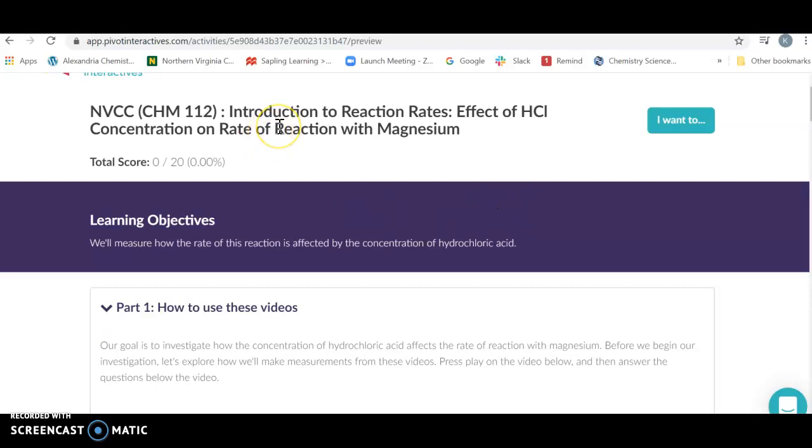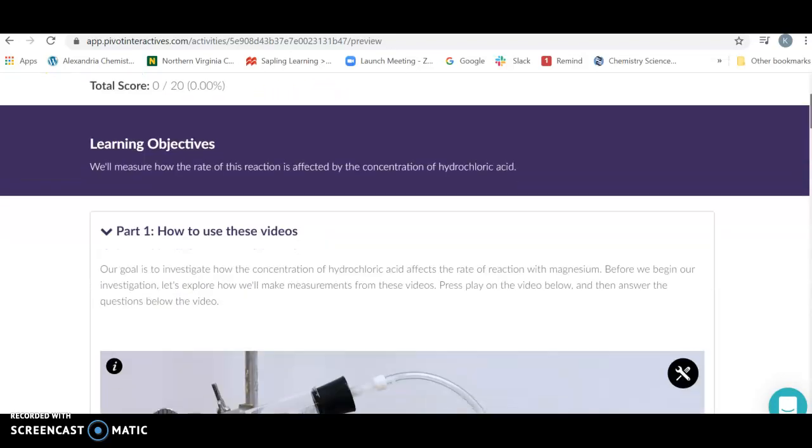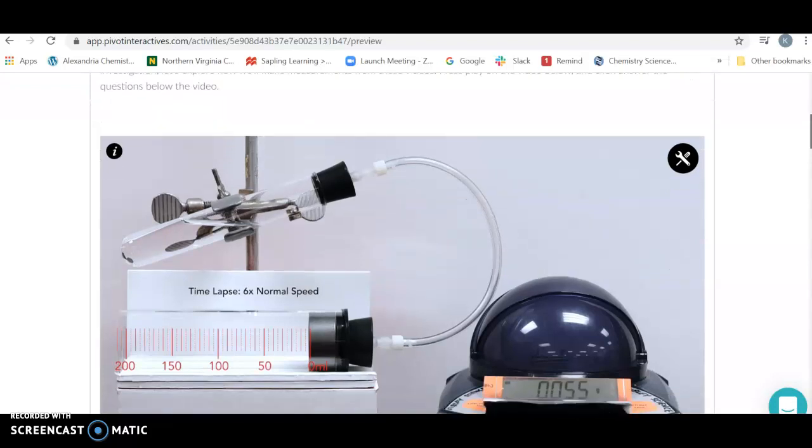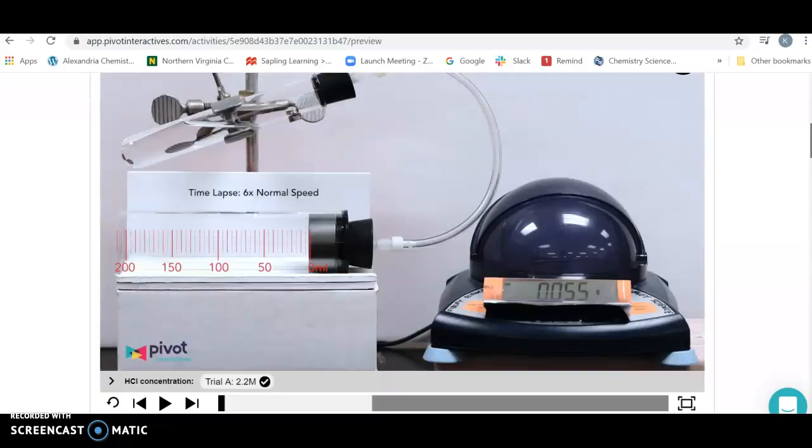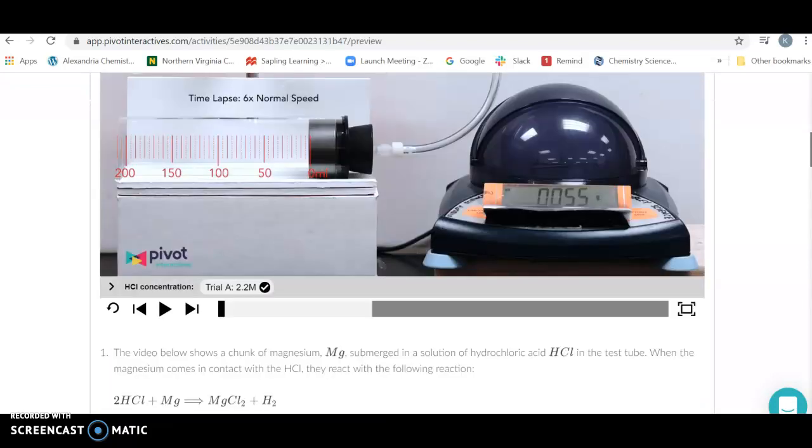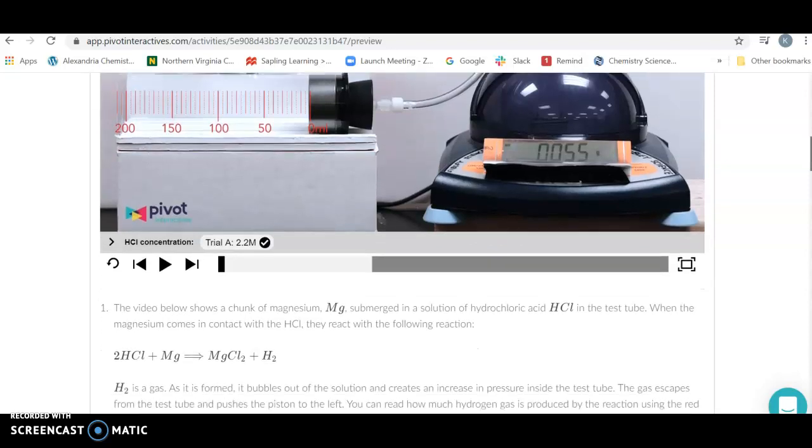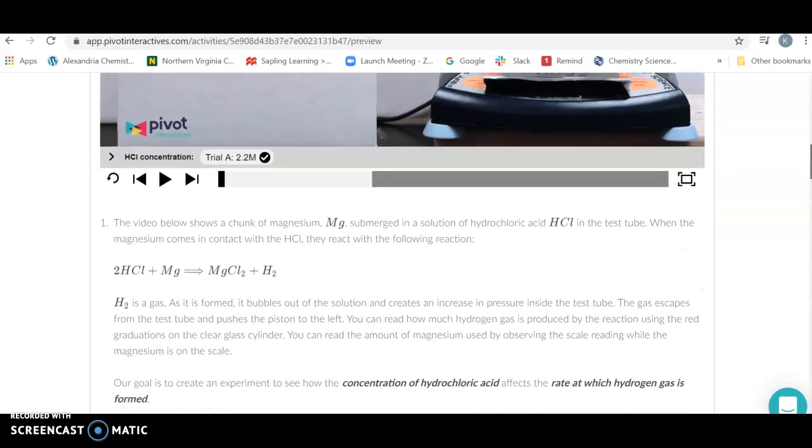The lab that we're going to be looking at is the effect of hydrochloric acid concentration on the rate of our reaction. We're going to look at a video of how much hydrogen gas is produced over a certain period of time to figure out what the rate is as a function of concentration.